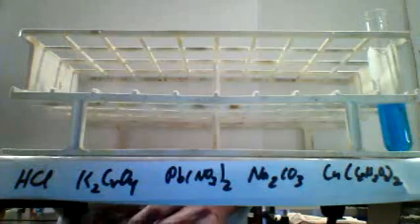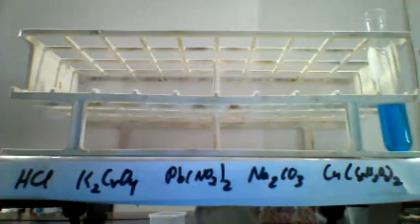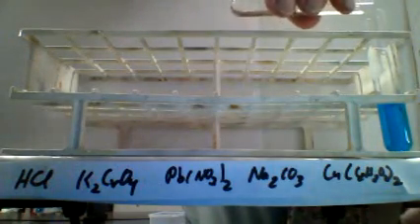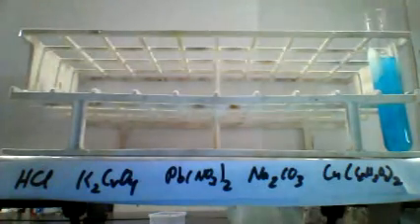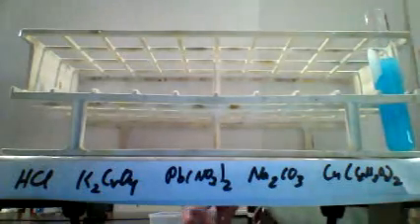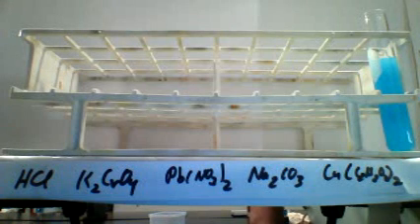And so we want to go on to the next row on our data table. Finally, we're down to our last two solutions, the sodium carbonate and the copper acetate. Pour them together and observe the results.